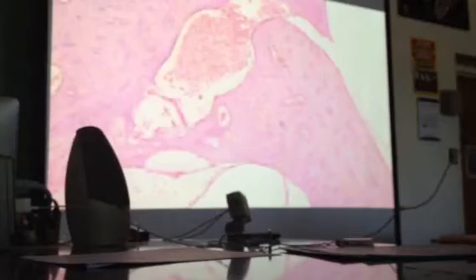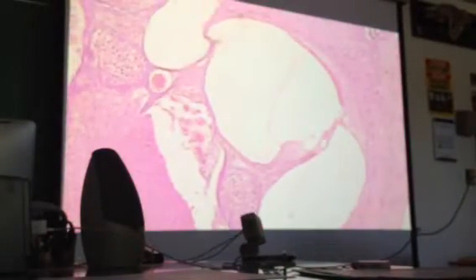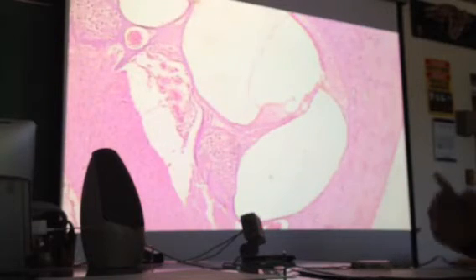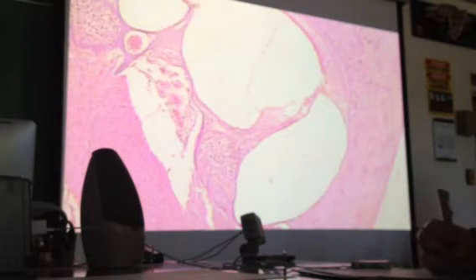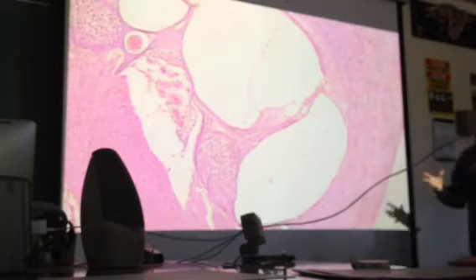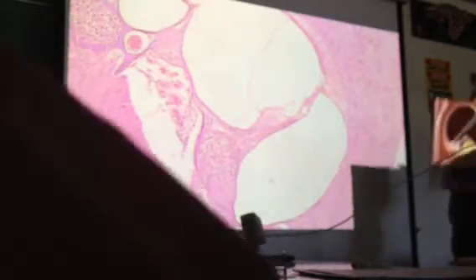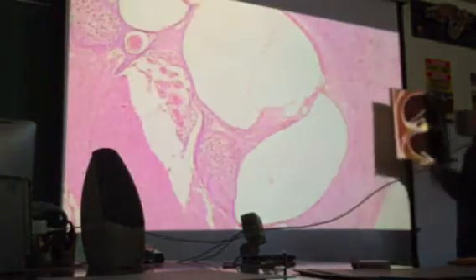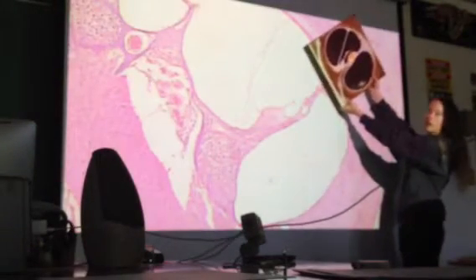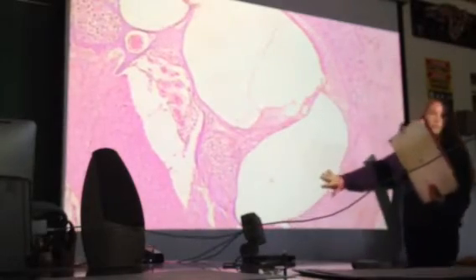Board model to show you. Because not only do we have these, there we go, okay. So we have slides of cochlea. We also have a histology board model, which is right up here. Make sure you also take a look at this, just to show you how it's oriented. This would be like that. Okay, so we're looking at this structure specifically right here.